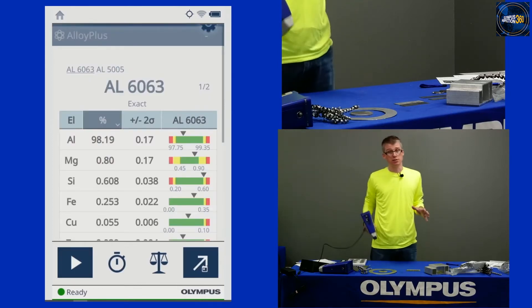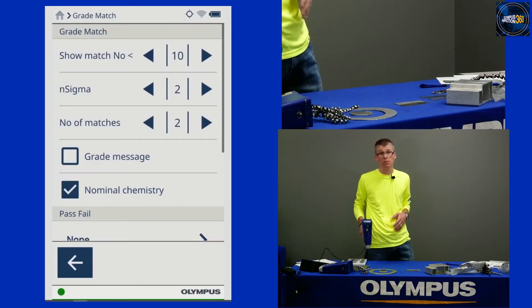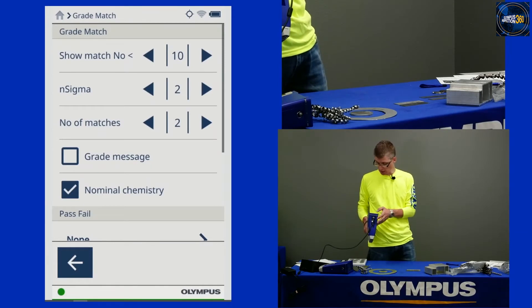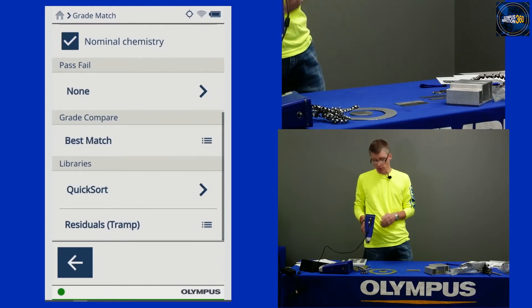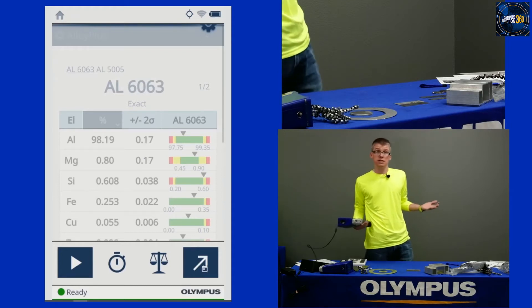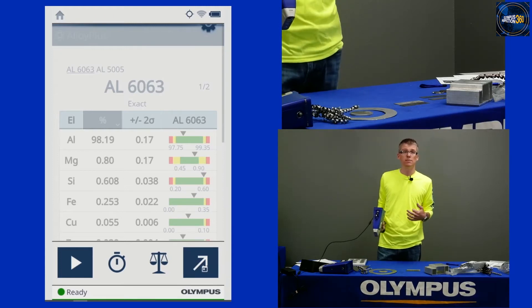The other thing to look at on the analyzer before getting started is the grade match settings — you can see the scales icon here. For the Vanta, I recommend 10-2-2 at the top. This is a set-it-and-forget-it setting; instruments ship this way but you can change it back if it gets changed inadvertently. We have a quick start guide available on the internet, YouTube, or from your sales rep. The key thing to highlight is our quick sort library, which we've developed for the Vanta. As the name implies, this helps you sort as quickly and efficiently as possible — make sure you've got that quick sort library checked. Most days I'll have this set up already and won't have to go through this exercise every morning; just set your grade match settings, beam settings, and test times, then go out into the yard.